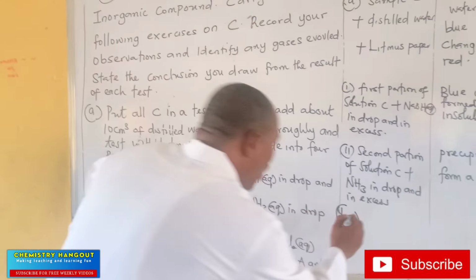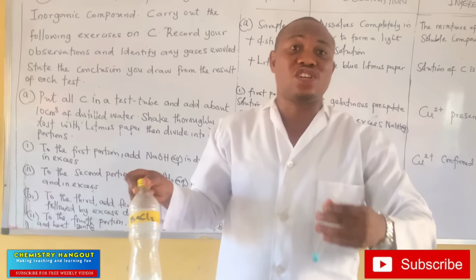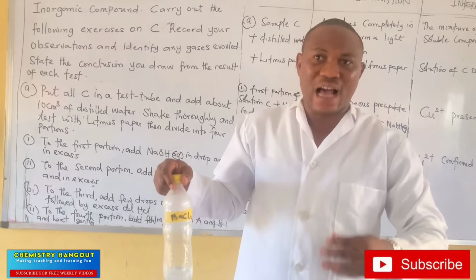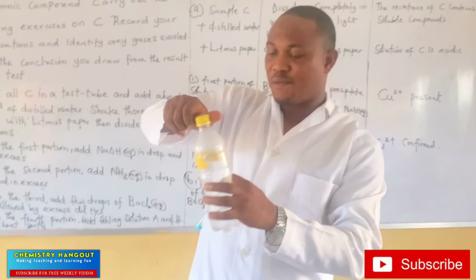Do I have my barium chloride here? Yes. That's why, as teachers, let's prepare the right reagent in the right proportion so that the test will be easier for the students. When they do all these things and see it, practical demonstration is very important. It excites them and they want to see that this thing is actually true. Practical is like an affirmation of what you have been reading in textbooks. If you cannot prepare those reagents, you can reach out to us.